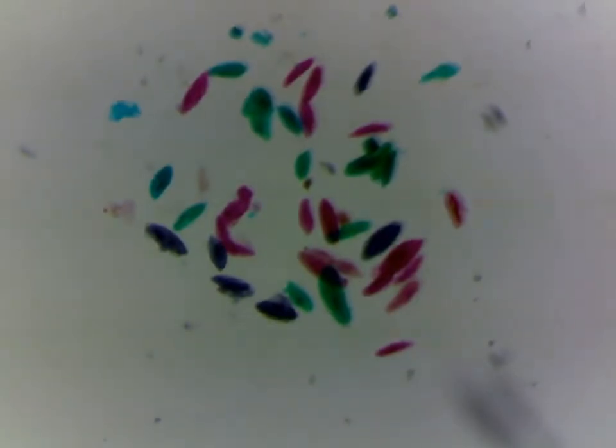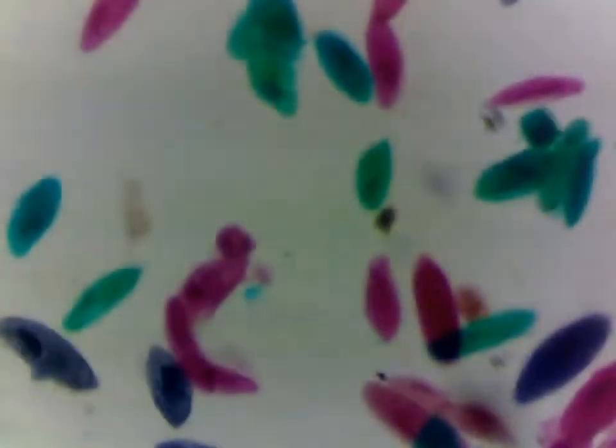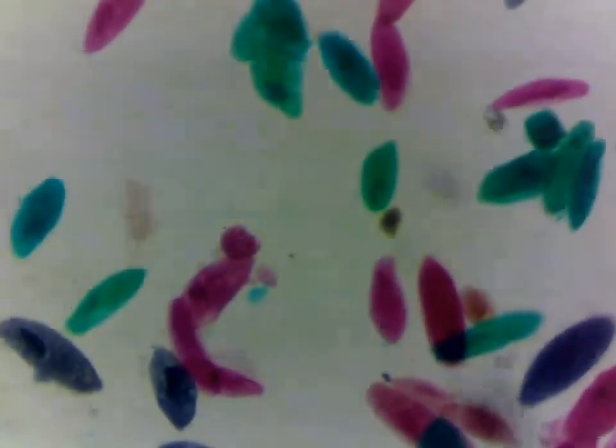Okay, next we're going to look at Paramecium, and I have several different stains on this one, but we're starting on low power, moving up to medium, and even though these are all different colors, they are all still Paramecium. You can see they all have the same shape. And so we're going to focus on medium power, and then we'll move and see if we can find a good specimen.